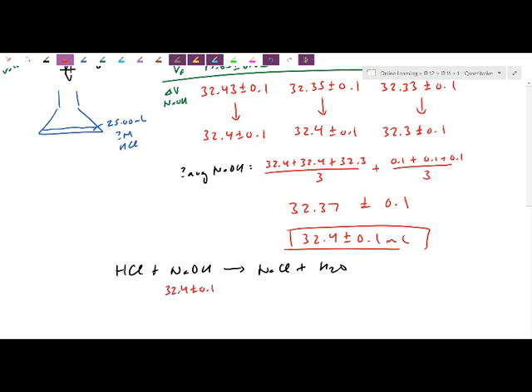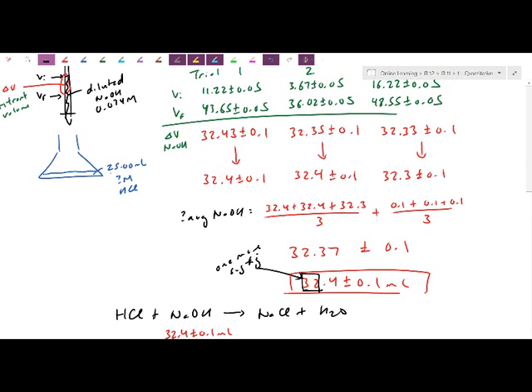One thing that isn't immediately clear here is you will notice, because I did the dilution a little bit on the low side for the NaOH, my titrant volume is actually bigger than 10. Yesterday's lesson, my overall average volume dispensed was only 9 point something. That only gave me 2 sig figs. Because our titrant volume is actually bigger than 10, we have 1 more sig fig here. So that's actually a good feature. We do want the base and the acid to be roughly the same concentrations, but we want to increase the precision if we can. One reason that happened was because I used a 25 mL pipette anyways, and that way I'm getting a little bit more detail. But nonetheless, let's just carry through.